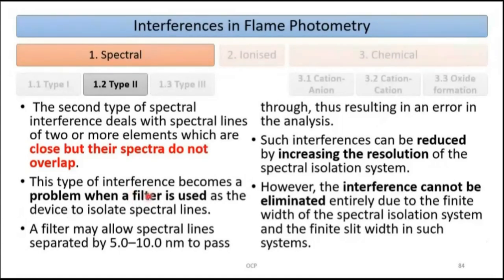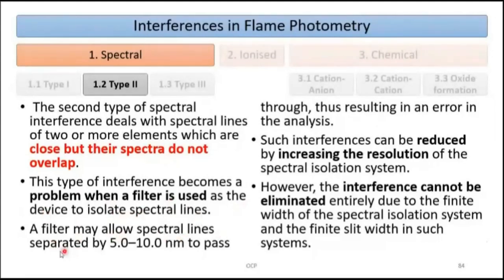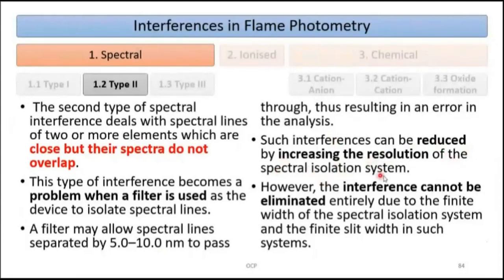This type of interference becomes a problem when a filter is used as the device to isolate spectral lines. A filter may allow spectral lines separated by 5 to 10 nm to pass through, resulting in error in the analysis. Such interferences can be reduced by increasing the resolution of the spectral isolation system — either by adding an additional filter or by using gratings.